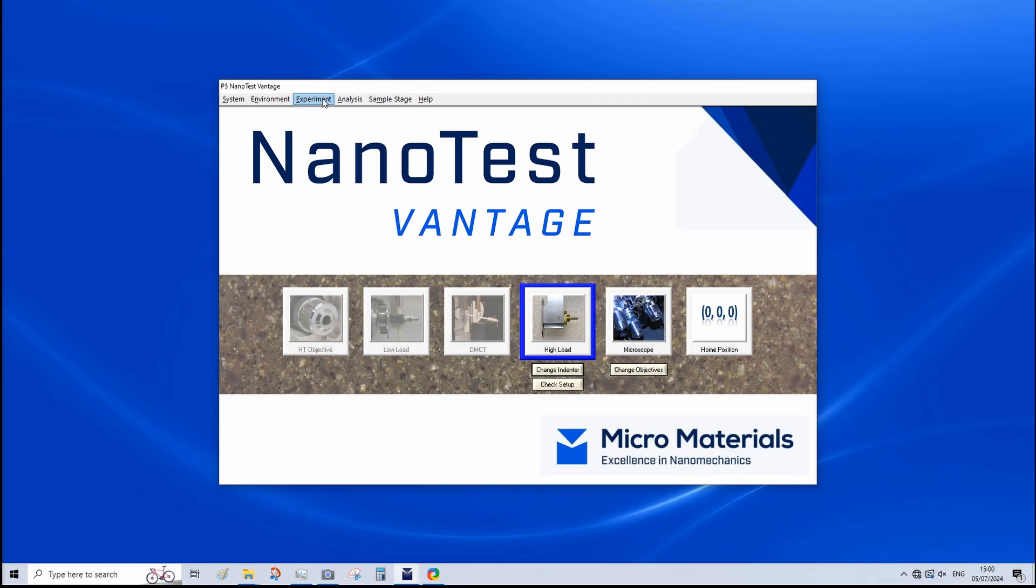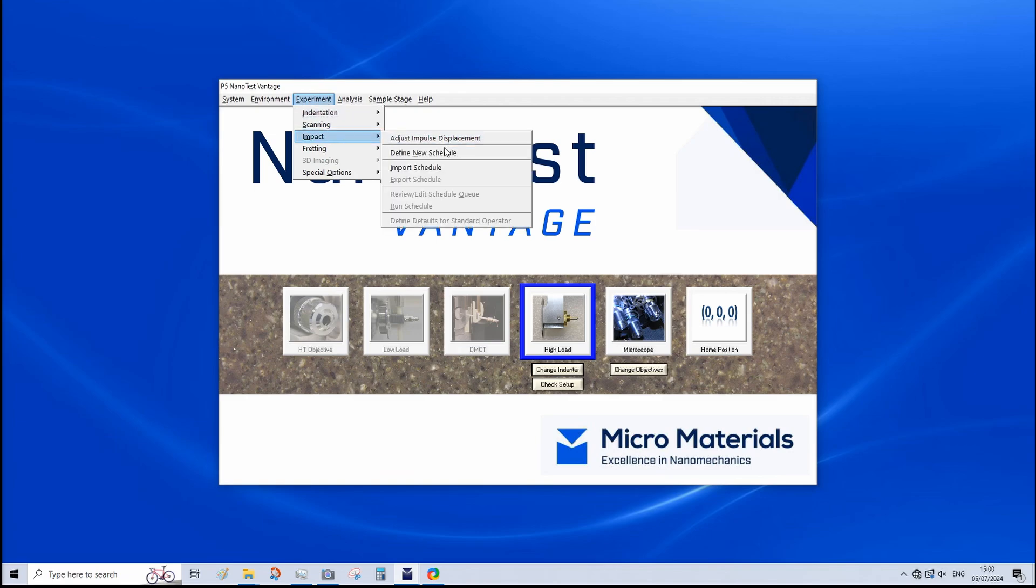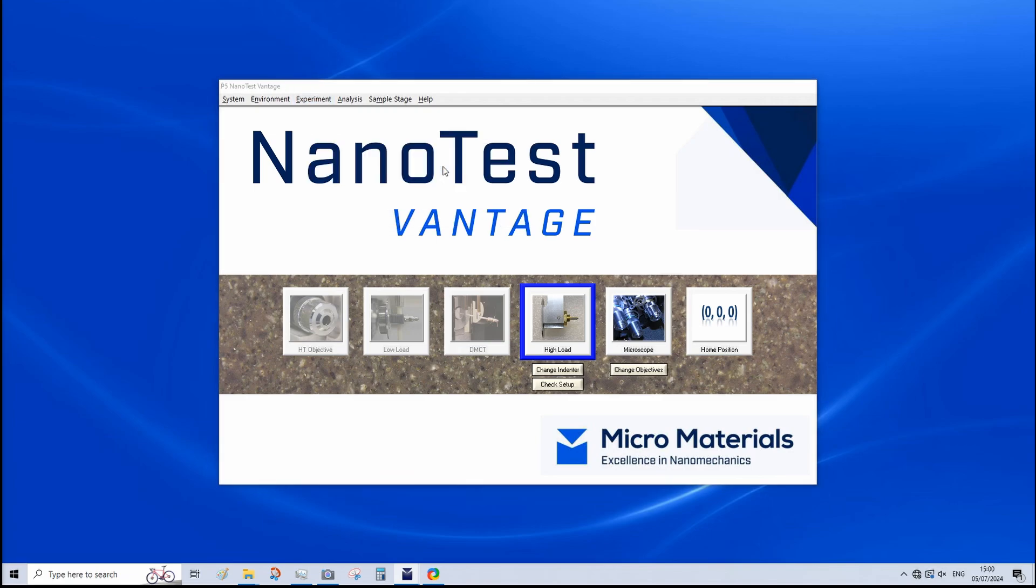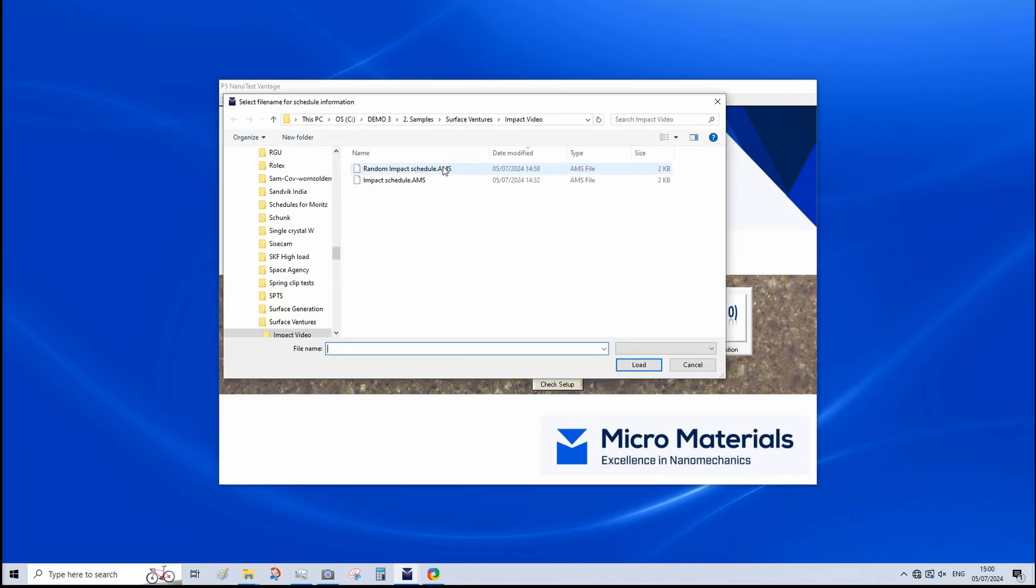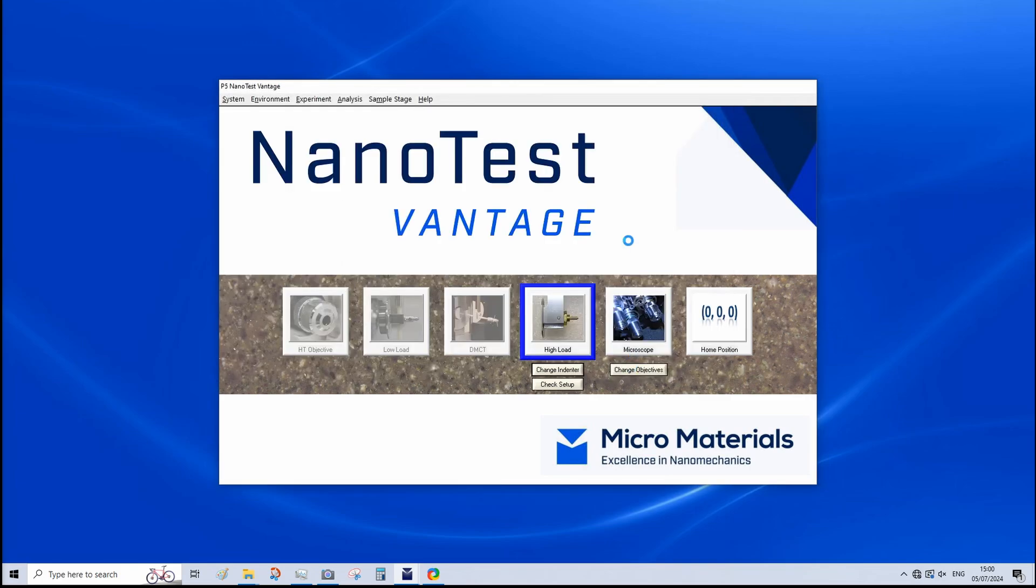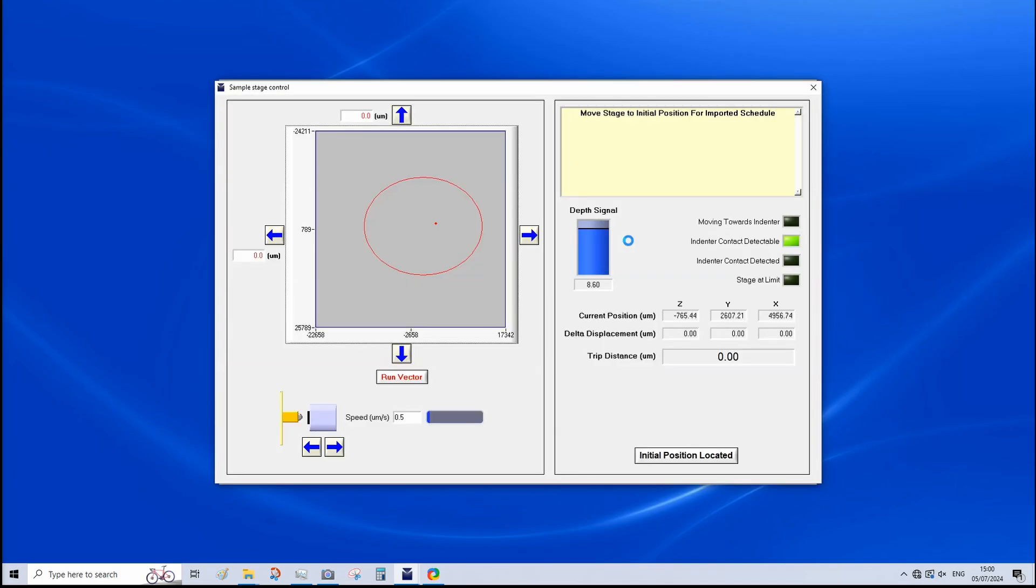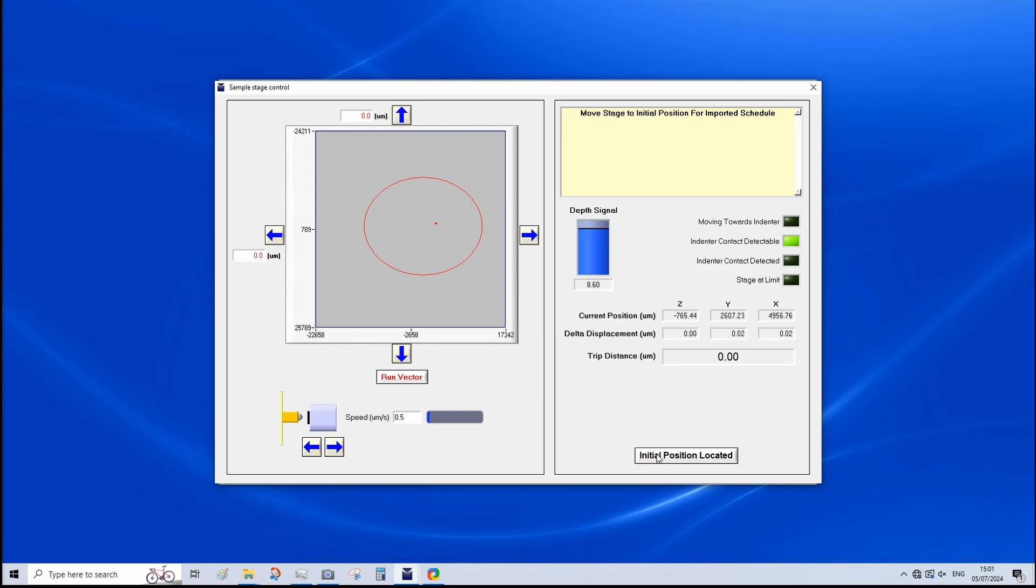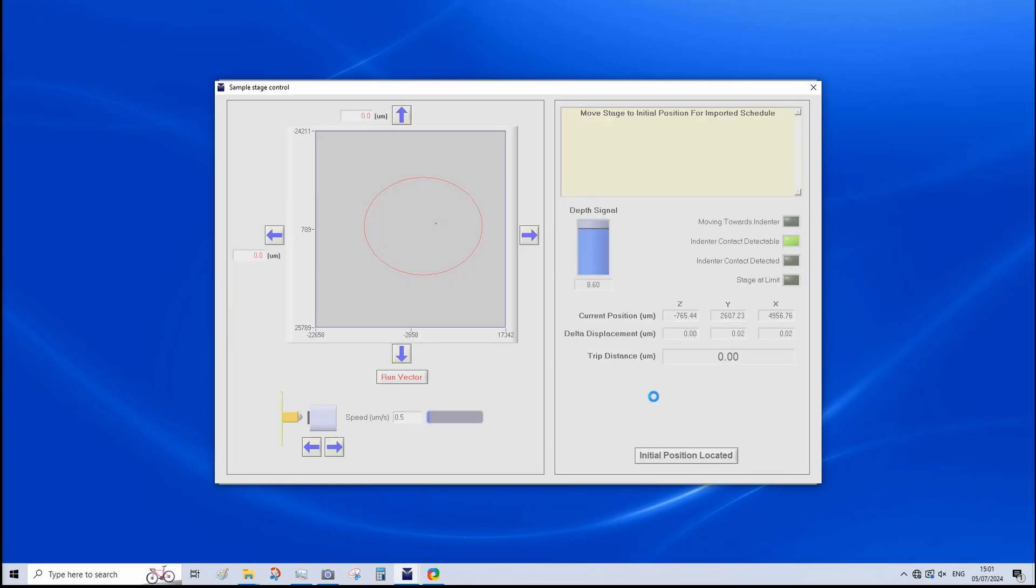So, as before, we're going to go to experiment, impact. We've already set up a schedule for this. I'm going to click import schedule, random impact schedule, and load. So, for information, we're using a different indenter to before. Previously, we had a cube corner, but now we have a 25 micron radius spheroconical indenter. And our sample is magnesia stabilized zirconia. We're already positioned on the micro loading head, ready to go. So, we're going to click initial position located.